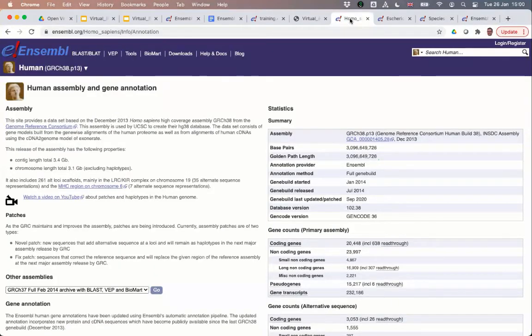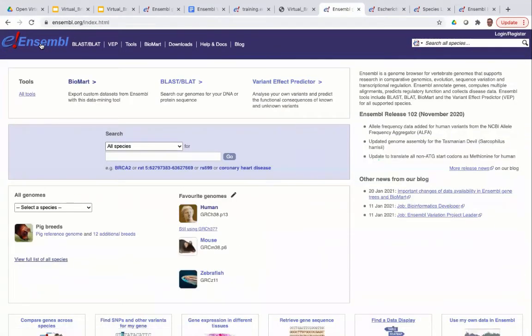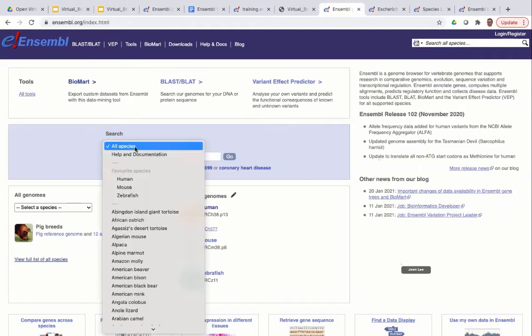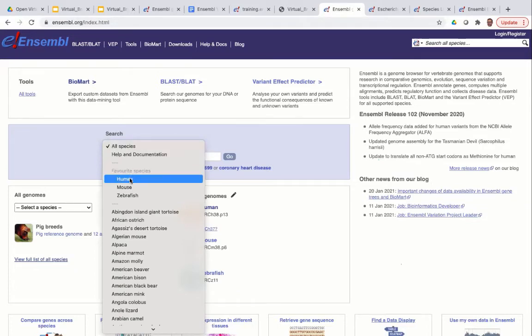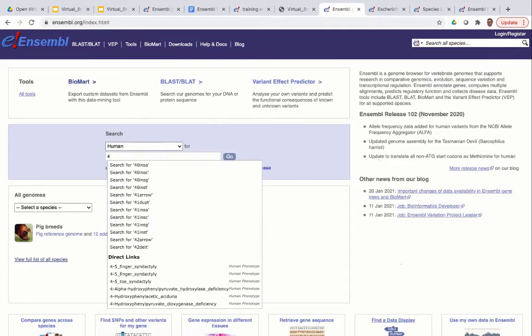I'm going to open up the Ensembl Genome Browser and click on the logo to go back to the homepage. I'll use the search bar to search for my region of interest. First, select human from the species drop-down at the top. Then in the search box, type the genomic coordinates: chromosome 4, colon, then the start coordinate 122868000, hyphen, then the end coordinate 122946000. I'll copy and paste that into the chat box for you too. Note that in Ensembl we don't use the CHR prefix before the chromosome number, and we don't use commas every three digits — it's just chromosome number, colon, start, hyphen, end, with no gaps or extra punctuation.